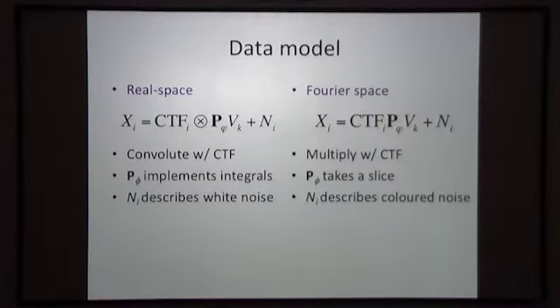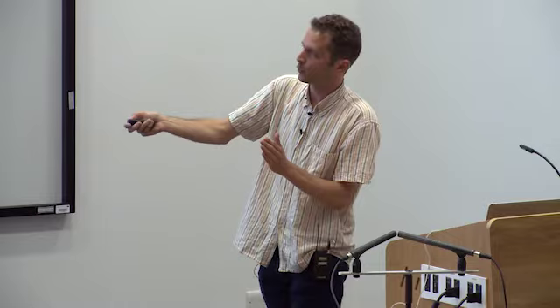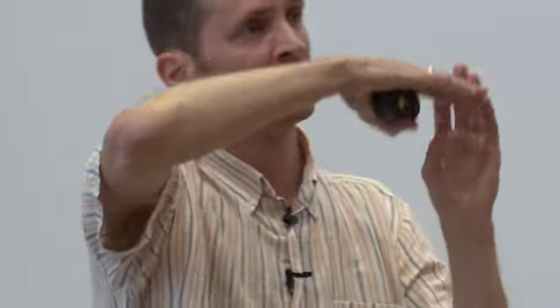And then in order to do this multiplication over all the Fourier components, not the real space pixels, we have to assume there's independence between the noise terms of all the Fourier components. And that is probably a much better approximation than assuming that the real space pixels are all independent. Independent real space noise is so-called white noise, and we know that the noise in our images is not white because everything falls off with spatial frequency.